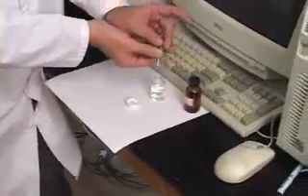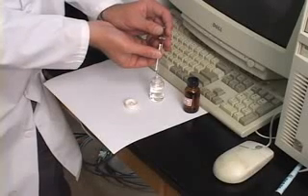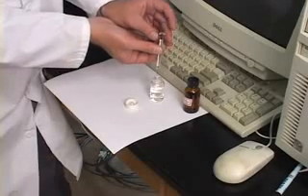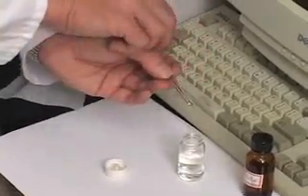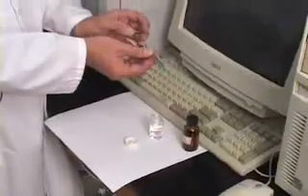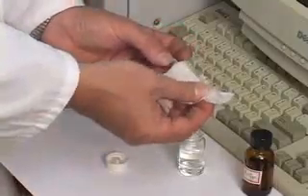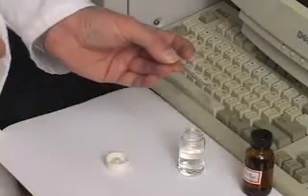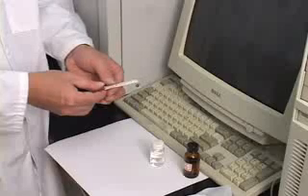This is done by inserting the needle below the surface of the sample and then pulling to the desired amount — in this case, one microliter. Once we reach that desired amount, we remove the needle from the liquid and pull the plunger until we see air enter the barrel of the syringe. We then wipe the needle clean and we are ready for injection.